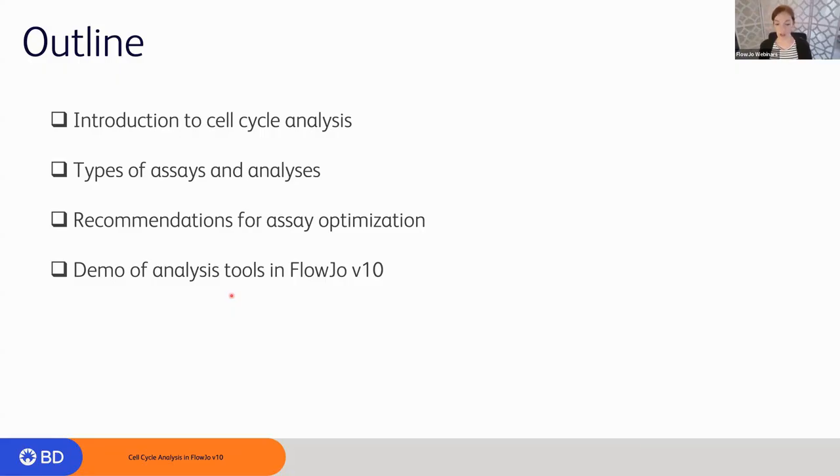That's really an entire topic in itself, but I thought I would spend just a few minutes mentioning some of the pitfalls we see that often hinder an interpretable analysis. So I'll have just a few suggestions for you when you're optimizing your assay, but I'll direct you to some of my favorite learning resources that dig into these topics in a little bit more depth and really get into the details of dye selection, staining time lengths, things of that nature. Okay. And then lastly, we'll spend a little bit of time in the software going through basic operation of these tools.